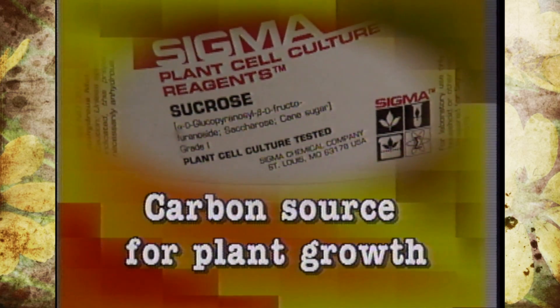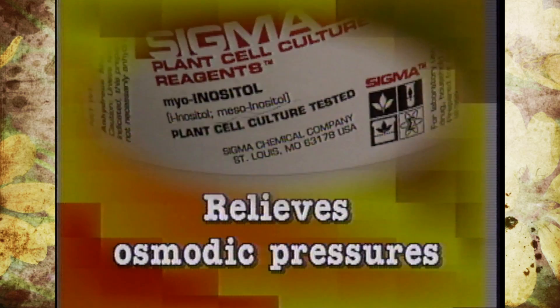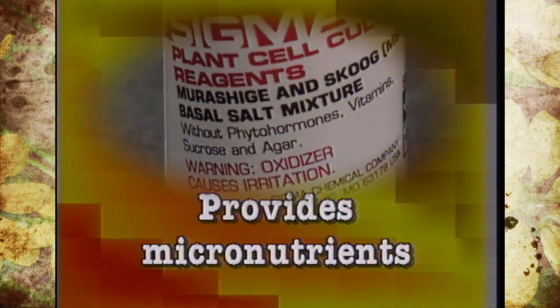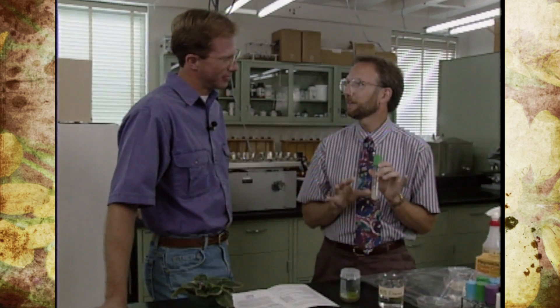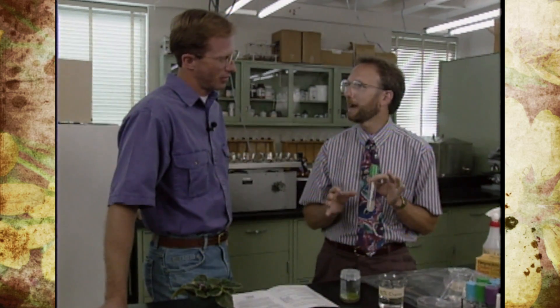We're using sucrose, or just common table sugar. There's also agar in here that solidifies the media so that it doesn't spill and gives a little support for the plant part we're going to place in there. There's a chemical called myo-inositol used as an osmoticum that helps relieve some of the osmotic pressures as we take a piece of a plant and put it into tissue culture. There are also various micro and macro nutrients — what's called Murashige and Skoog salt base, named after two gentlemen who pioneered the field of in vitro culture, determining what was essential for these plants to grow. It functions kind of like the fertilizer component.